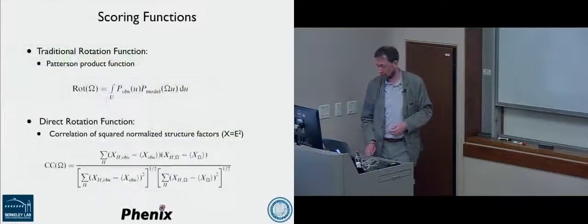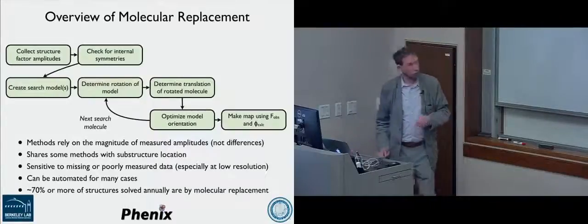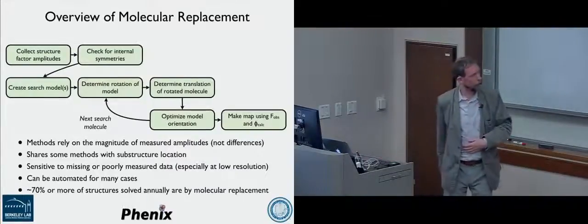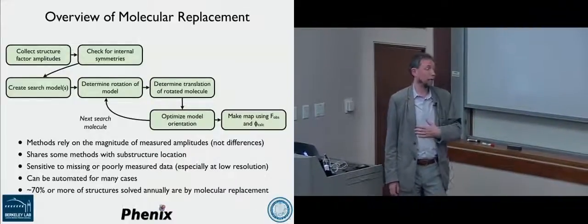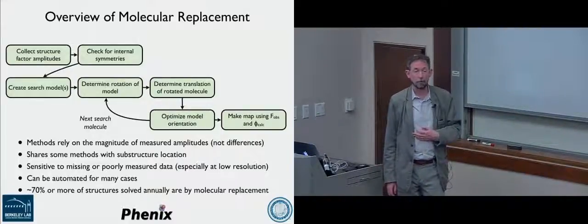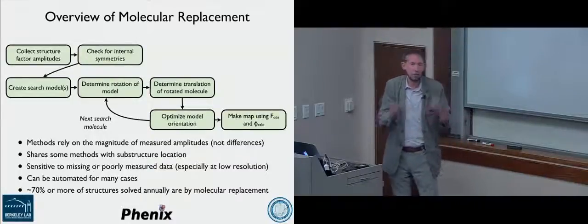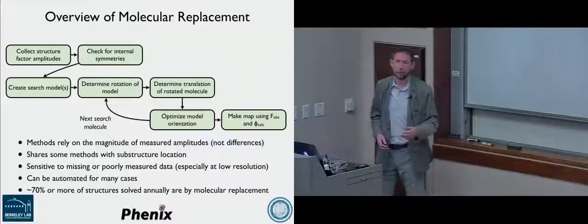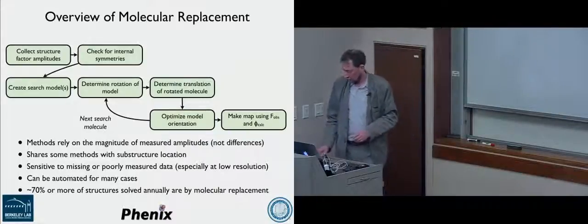So that's good news. So again, what kind of resolution are you using here? All sorts of resolutions. People solve problems at, we've done things in my group at 6 angstrom resolution. But people are often doing things at 1.5, 2, 3. That's the other good thing about molecular replacement. You don't have to have high resolution for it to work.